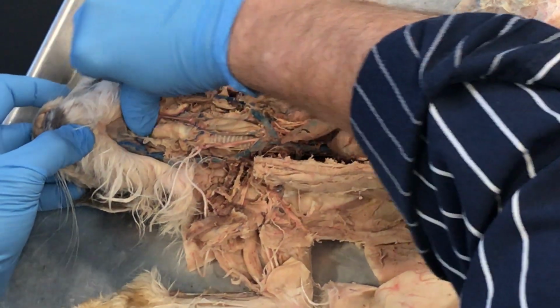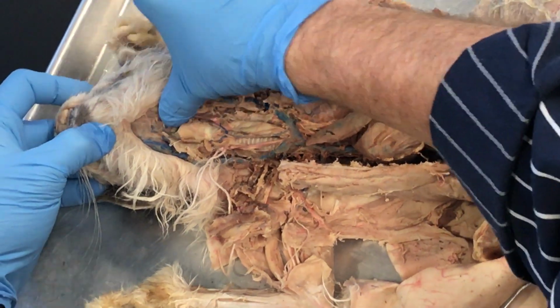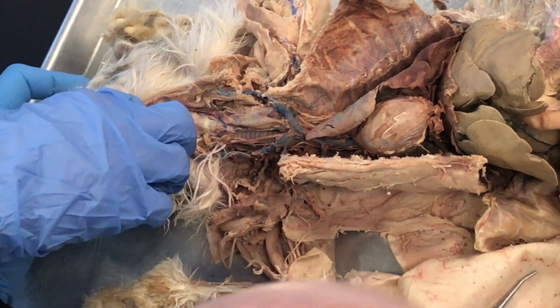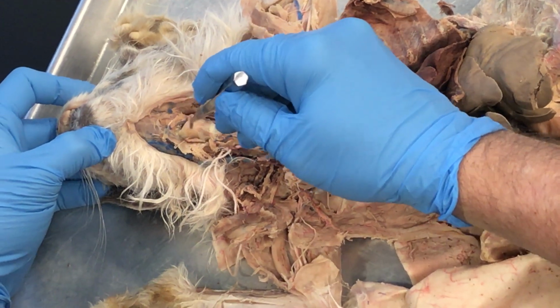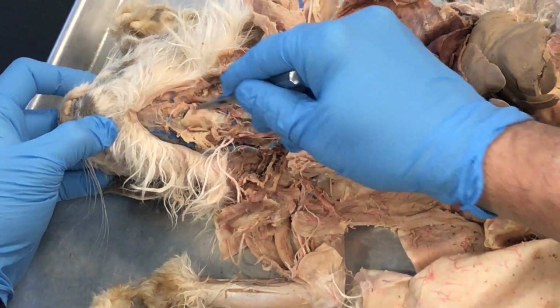Well, you got your gloves on, but I want you to be careful because the teeth are sharp. But what I want you to do is, there's the thyroid cartilage, and I want you to kind of feel up here, and you'll feel a little bit of a ring or a ridge right there. Feel that for me. You feel it? So that's hyoid bone. So you've got hyoid bone here, thyroid cartilage right there, and then the cricoid cartilage is this cartilage right here. And the tracheal rings come down from that.